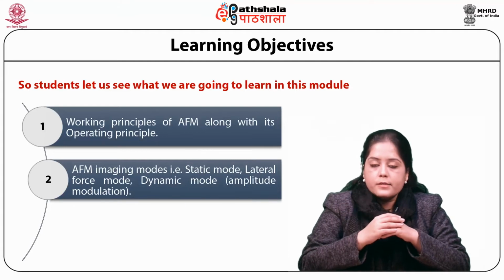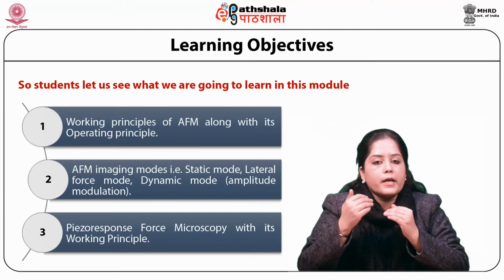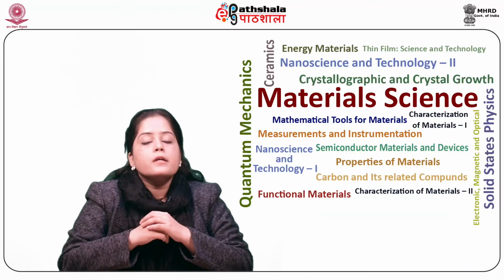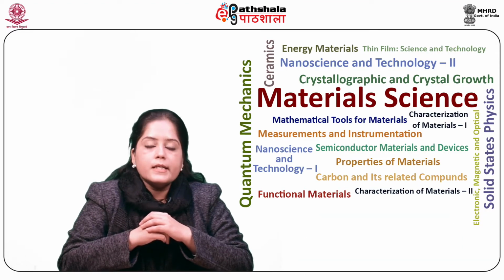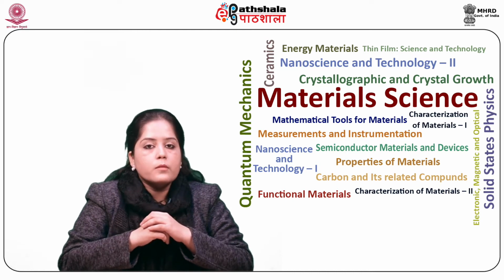Third, we will discuss piezo response force microscopy with its working principle. So, students, let us start with the basic introduction about the module.